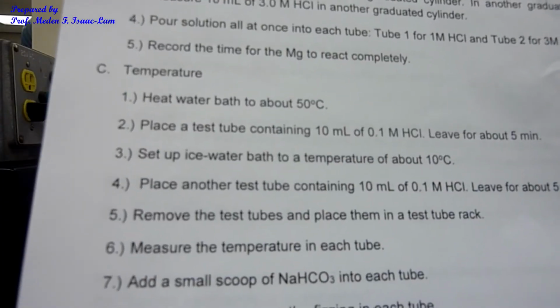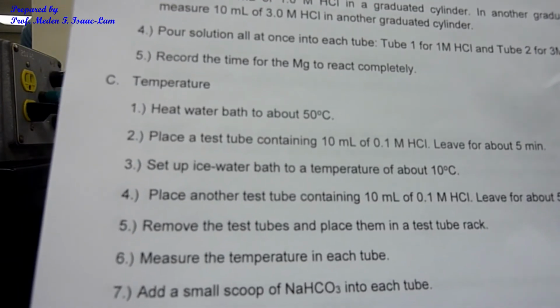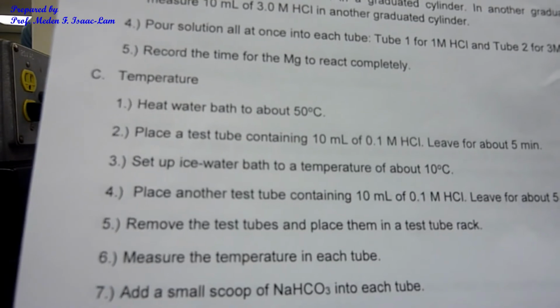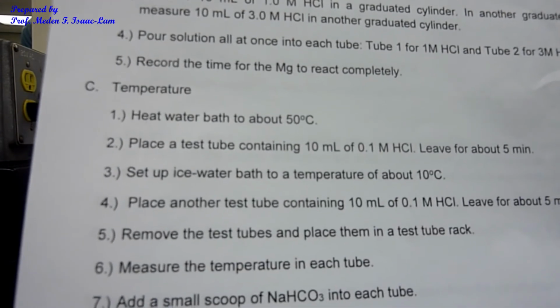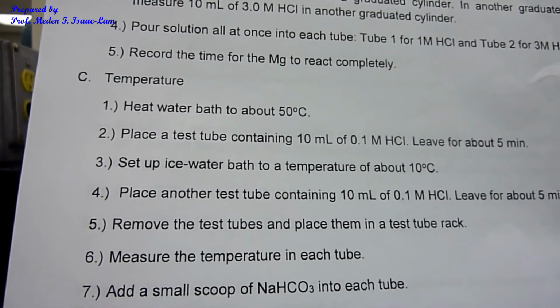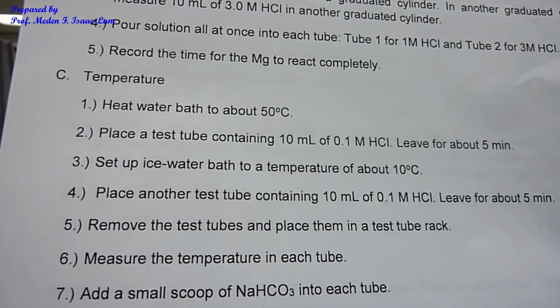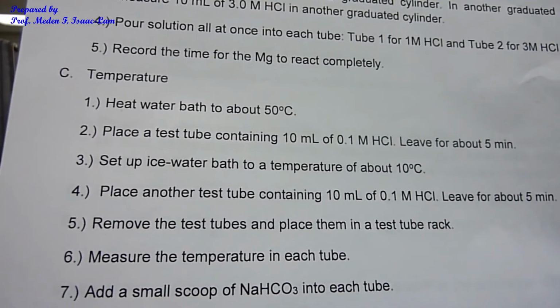Part C is the effect of temperature on the reaction rate. So I'm going to heat up a water bath to about 50 degrees C, and then I'm going to place 10 mL of the 0.1 molar hydrochloric acid in the tube, and the other one is going to be at lower temperature.